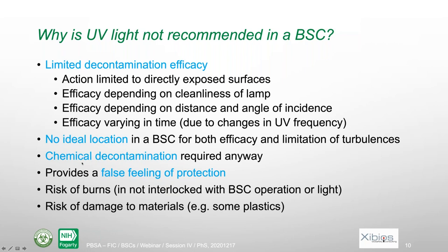Then, in any case, you will need the chemical decontamination, which is more and more efficacious. So you don't really need UV light. And using UV light can give you a false feeling of protection. You might be in a mood that, yes, we use UV light, so why do we need to care? But no, it does not really inactivate very well, so it's better not to have it. So those are the main reasons.